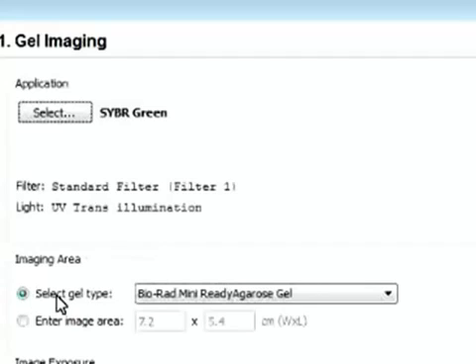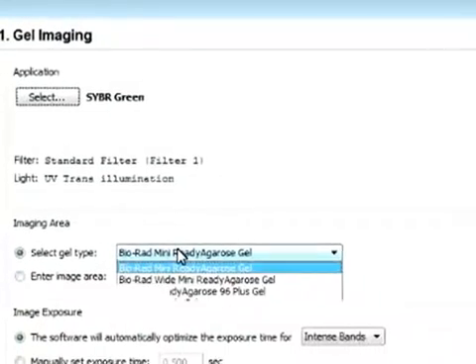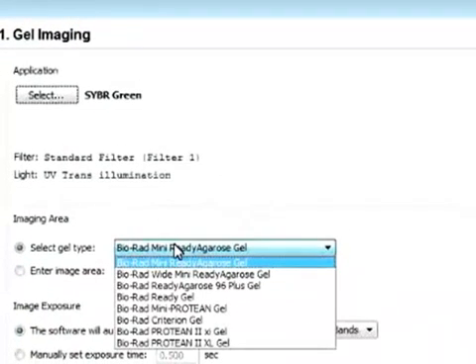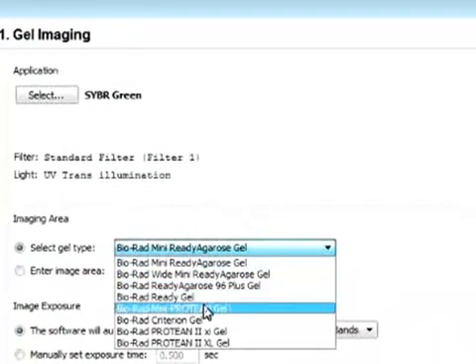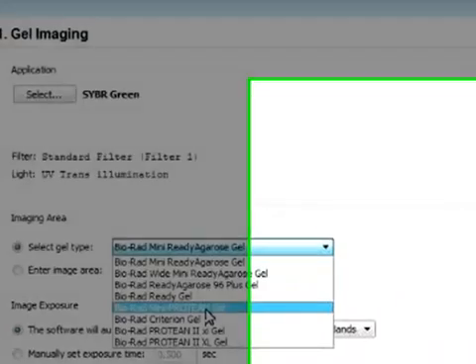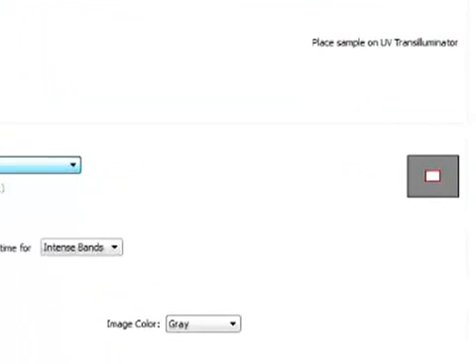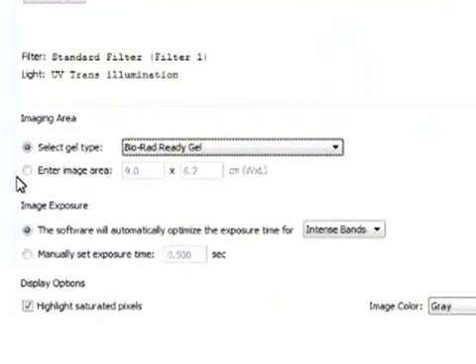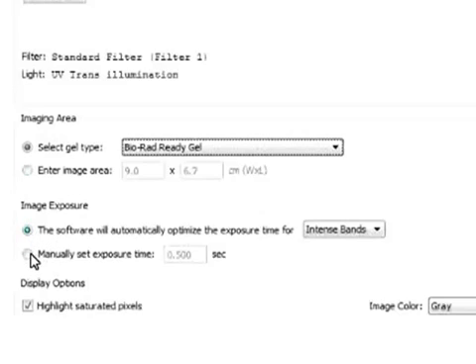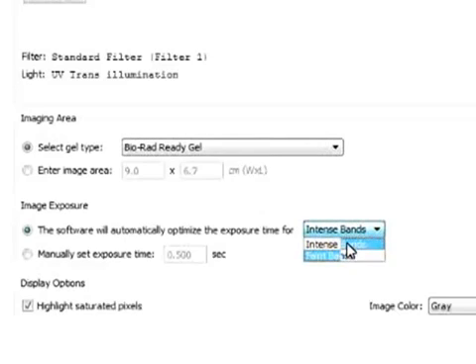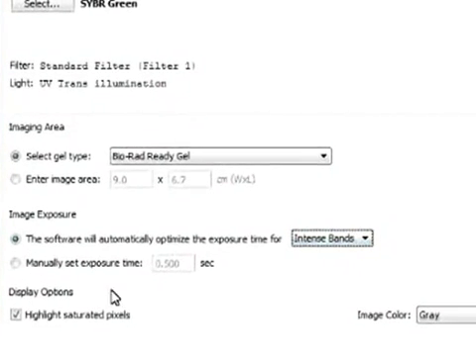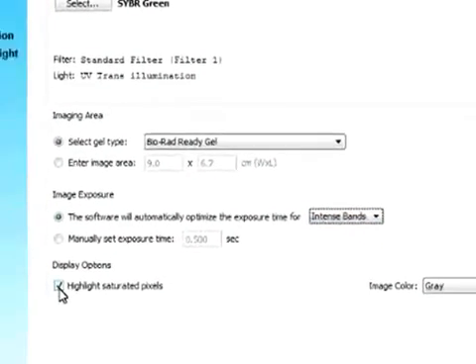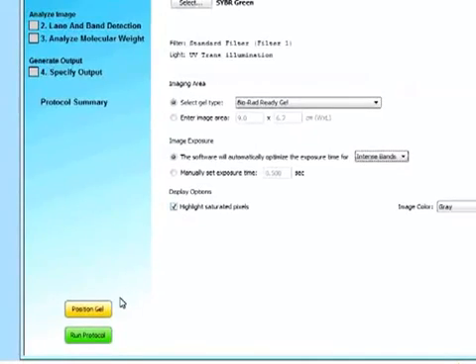Next we can select the imaging area. So if we have purchased a specific Bio-Rad gel, we can select it. And you can see how the area changes. And we can also enter the imaging area. We can set the image exposure time either manually or automatically, looking at intense band or faint band. And we can select to highlight saturated pixels as well.